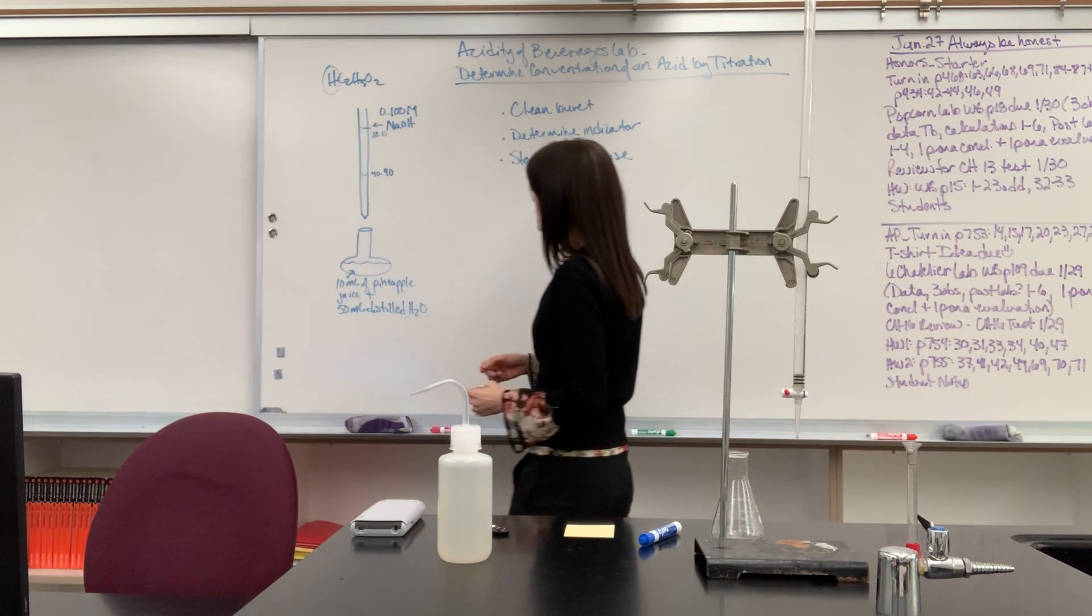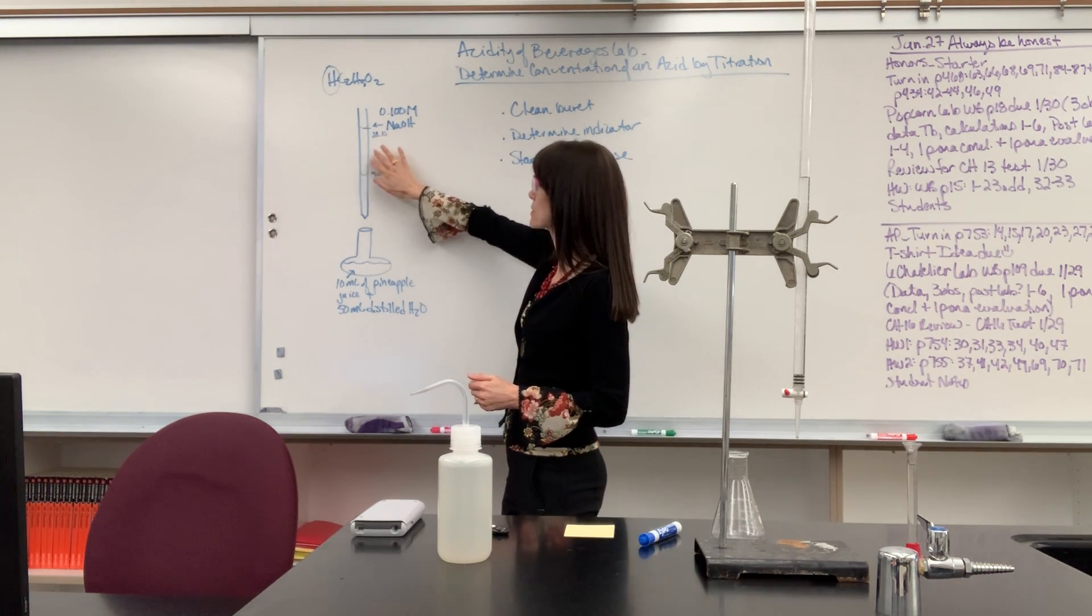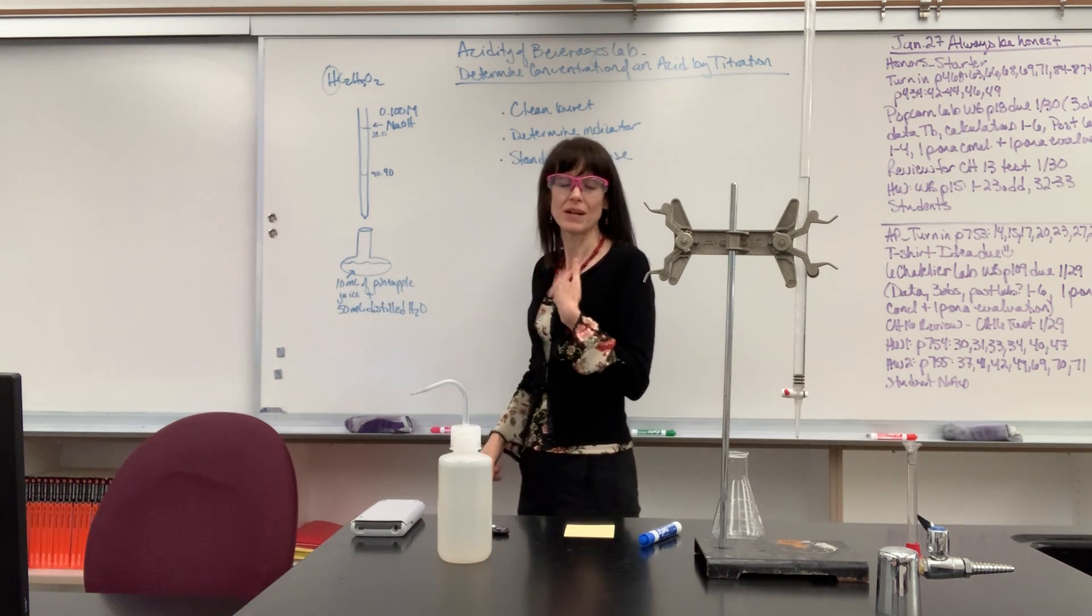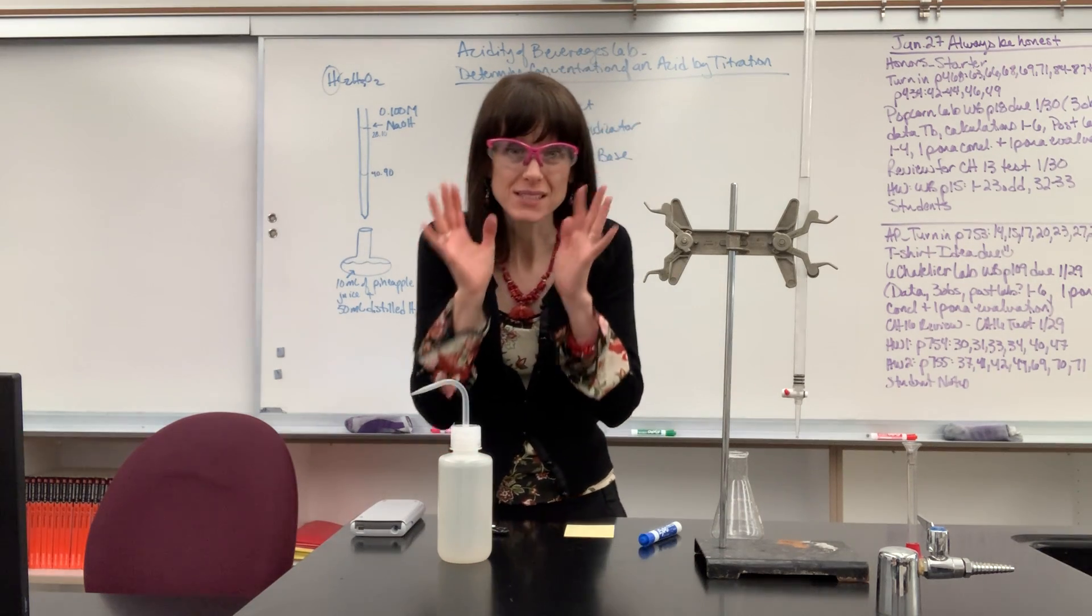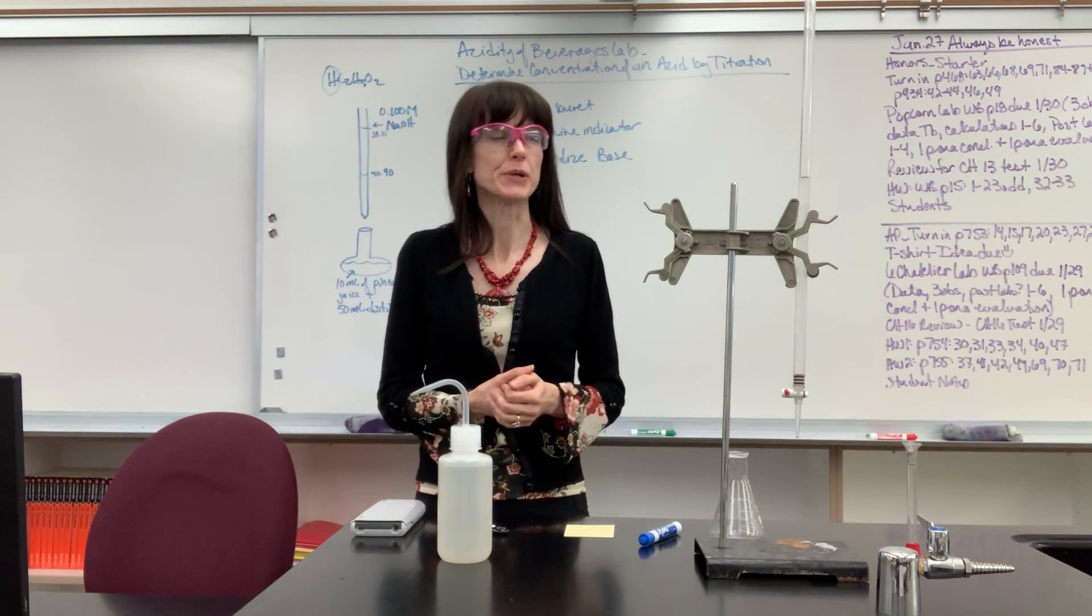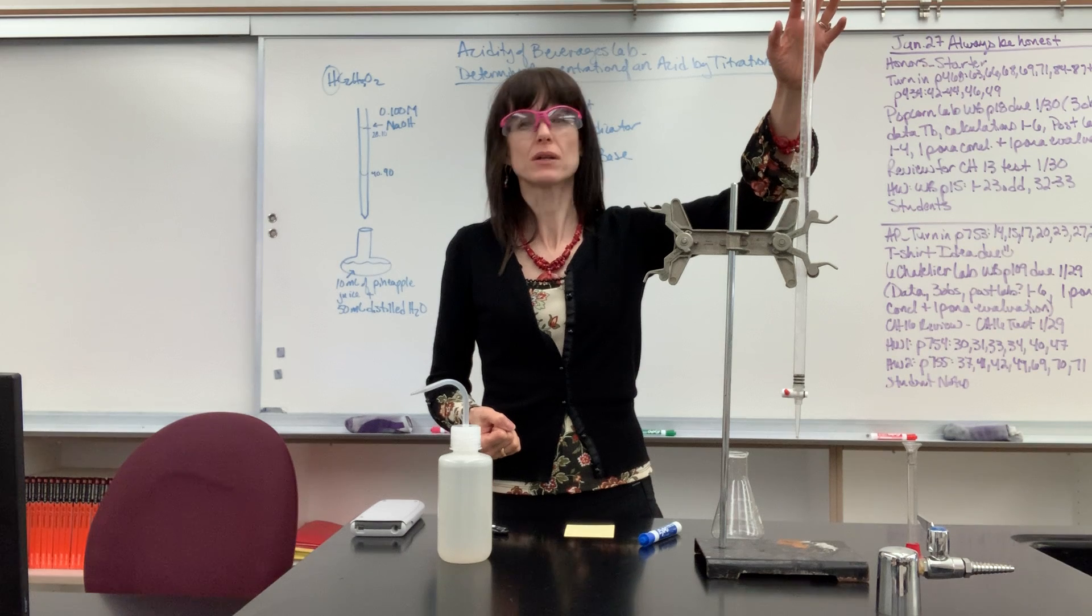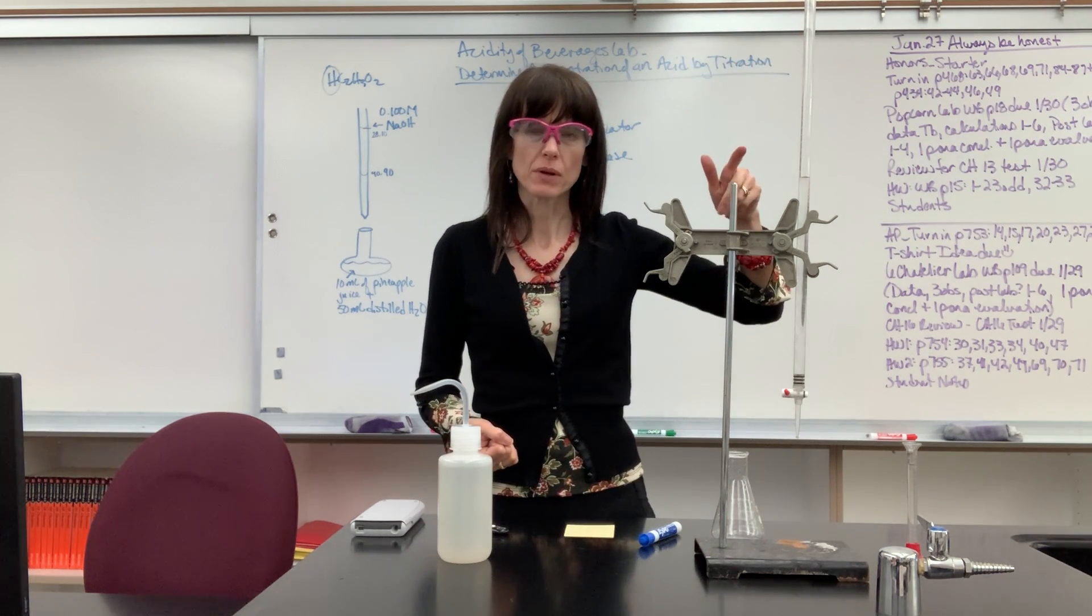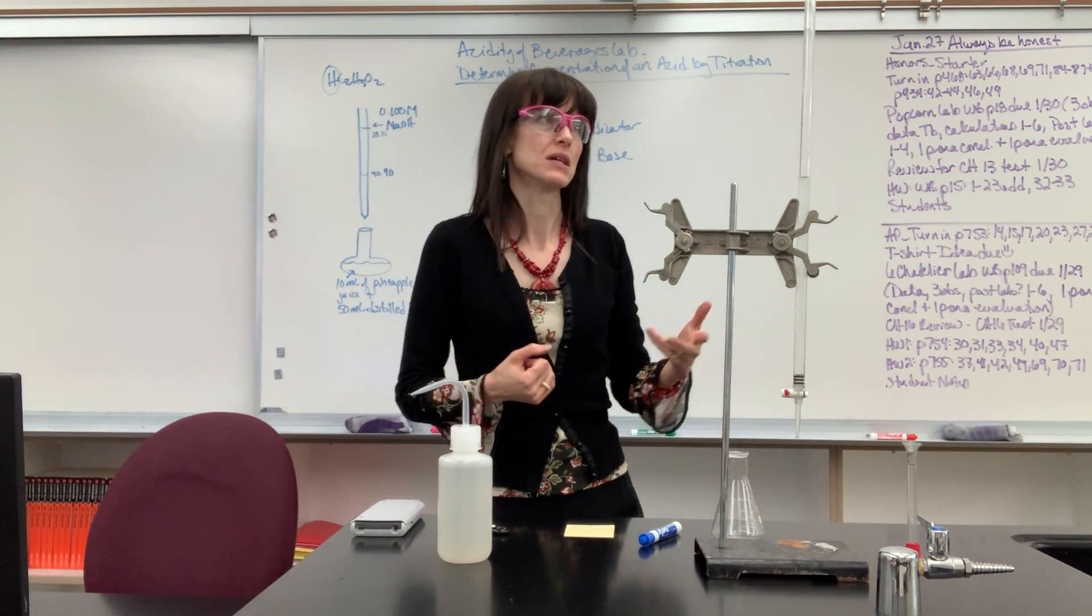Most of the time, though, you'll just be given the sodium hydroxide standardized. So we're going to have sodium hydroxide in the burette. That's called the titrant. The analyte is what's being titrated. For my students, we're going to use different juices, and in this example, I'll say that it's pineapple juice. I'm wearing safety glasses, but I'll be honest to you guys, this is just all water. I'm just trying to demonstrate what you're going to do. So you're going to fill up your burette. I recommend go pretty close to the top, kind of close to that one. Be careful reading burette. It feels kind of anti-intuitive.